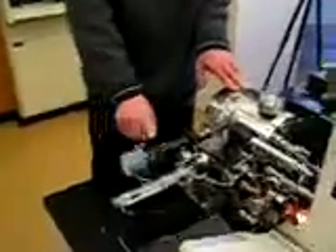Then the pressure will be equalized, and this trapdoor will open up, and the plate can be ejected. This digital motor is for the x-axis motion of the plate. Since the laser beam is not moved, it's actually the plate. And there's another y-dimension digital motor and assembly positioned down here.